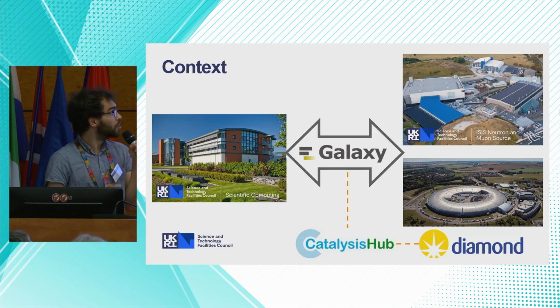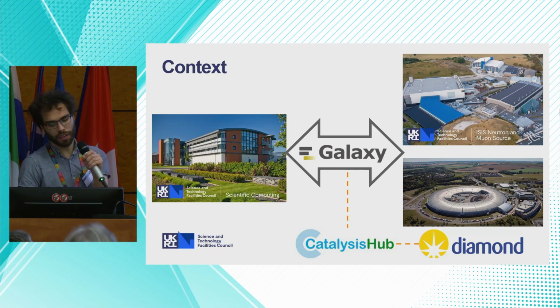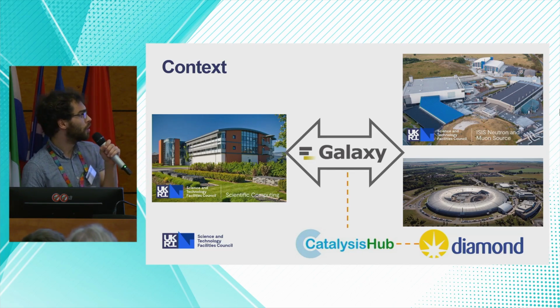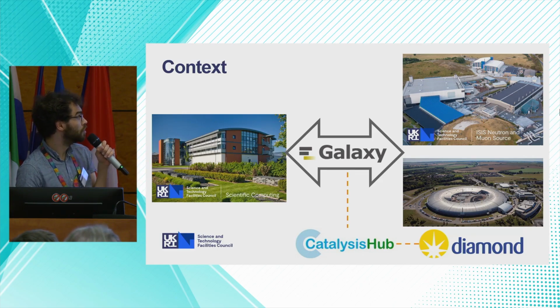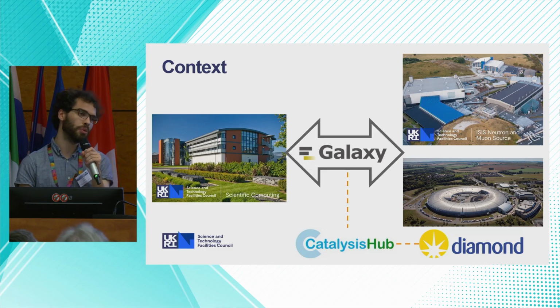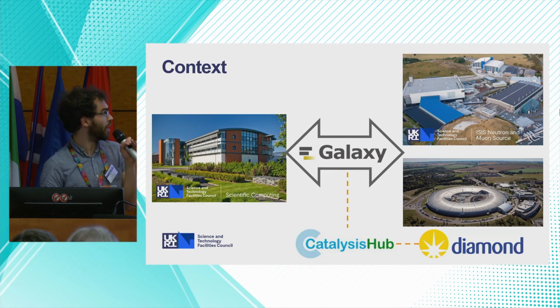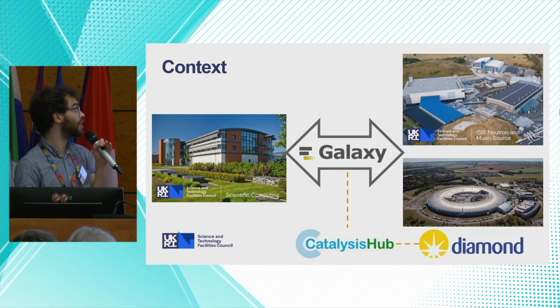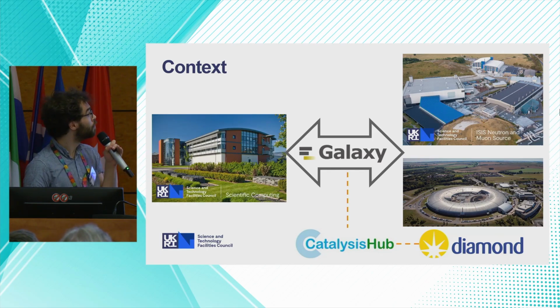In this piece of work, we've been using it for an application involving X-ray absorption spectroscopy for users of the Catalysis Hub. The Catalysis Hub is also based at the Harwell site and essentially acts as a kind of intermediary between researchers in catalysis and Diamond, where they can apply for a block of beam time as a group. And it is a member of the Catalysis Hub who approached us about this potential use case that we're going to talk about today.